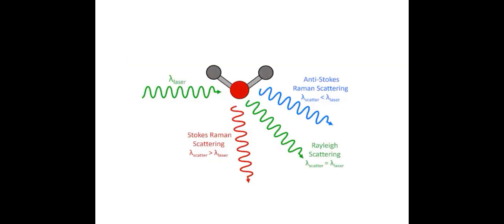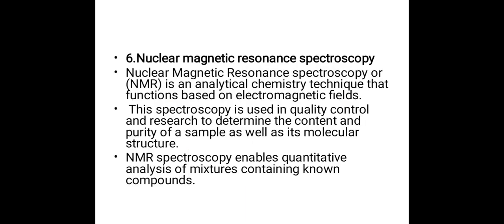Laser is applied. Raman scattering is happening. Anti-Stokes scattering, Stokes Raman scattering, and Rayleigh scattering are also happening.